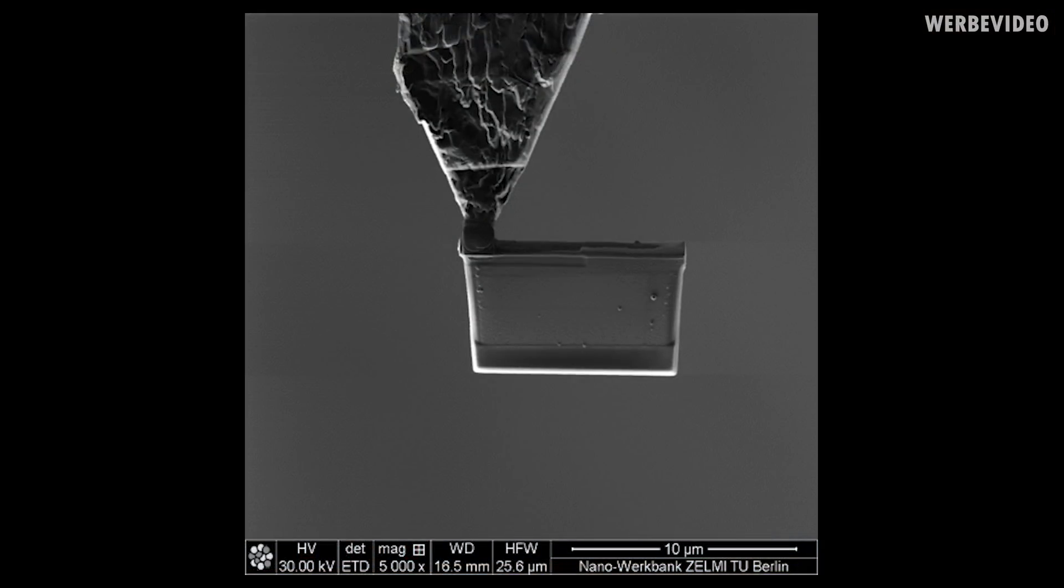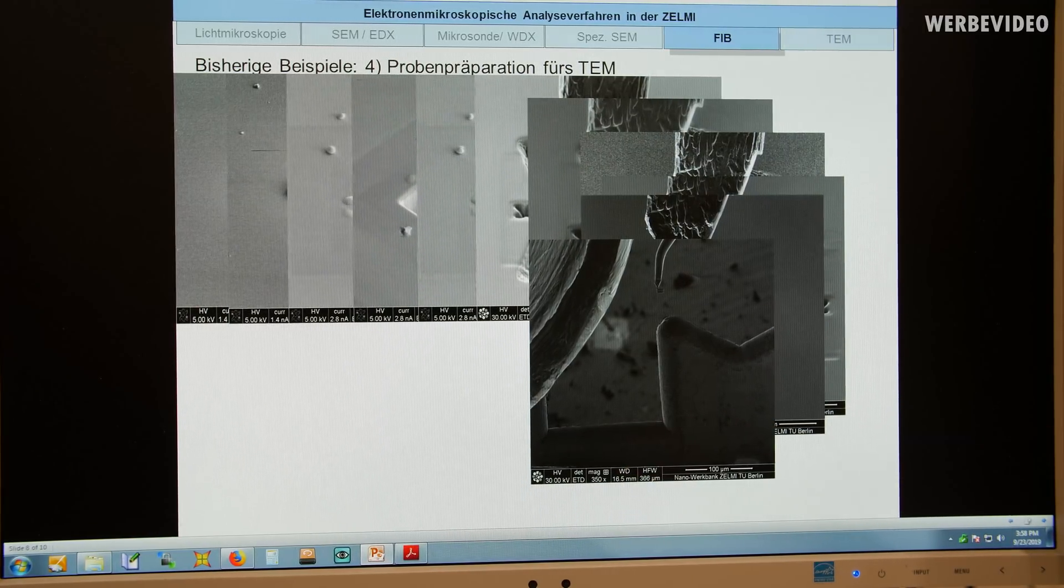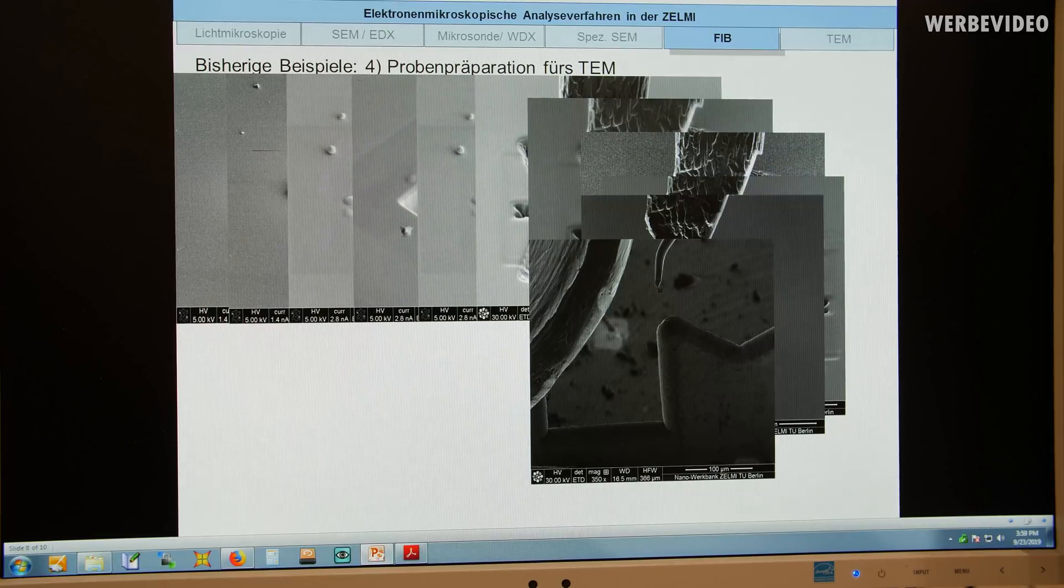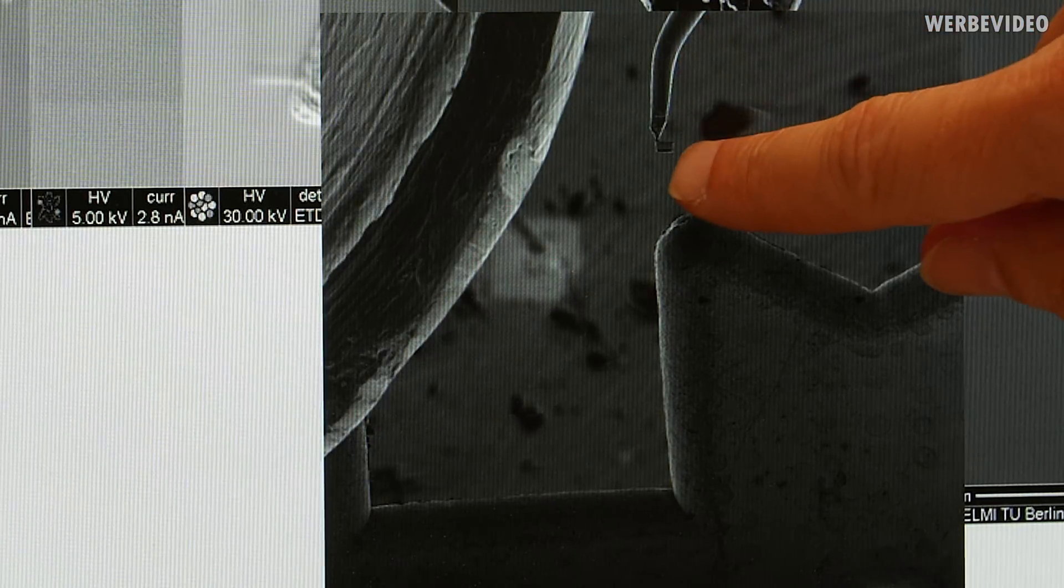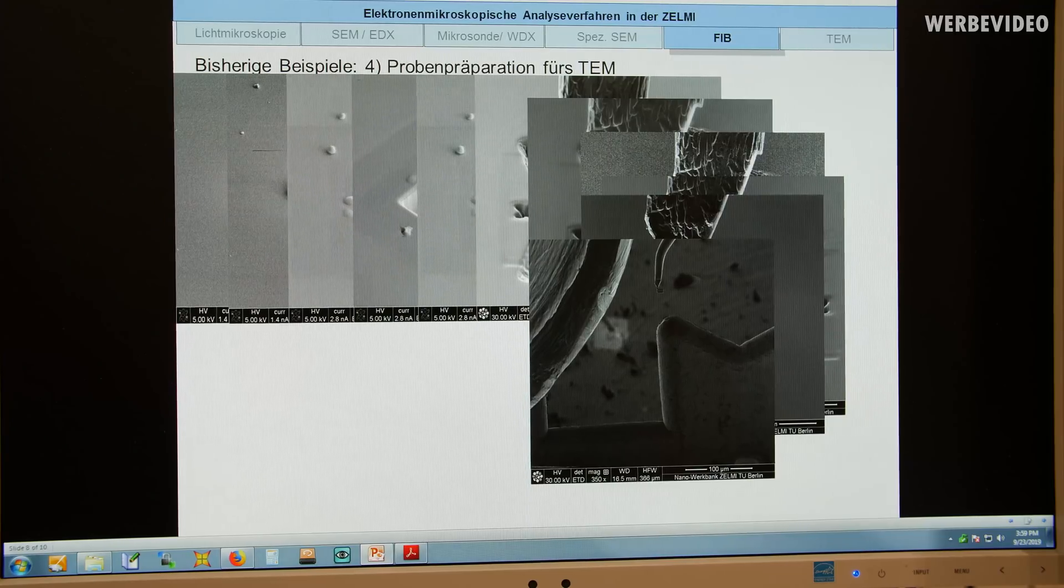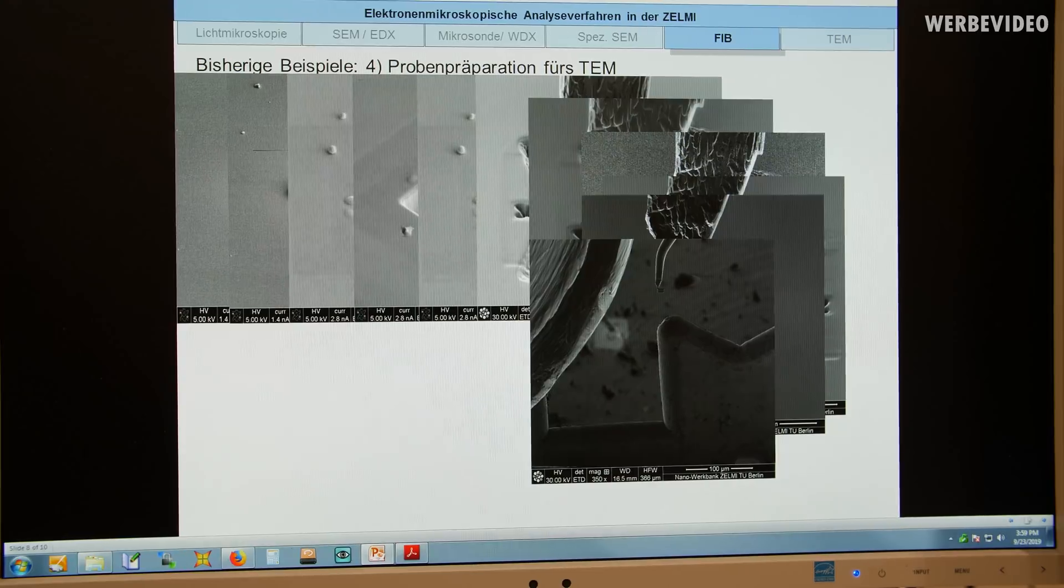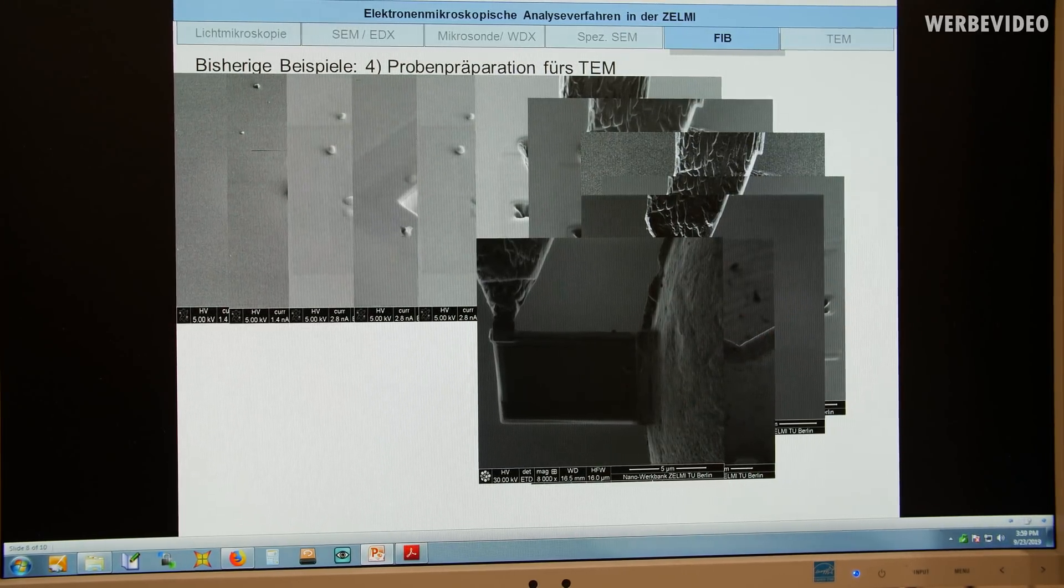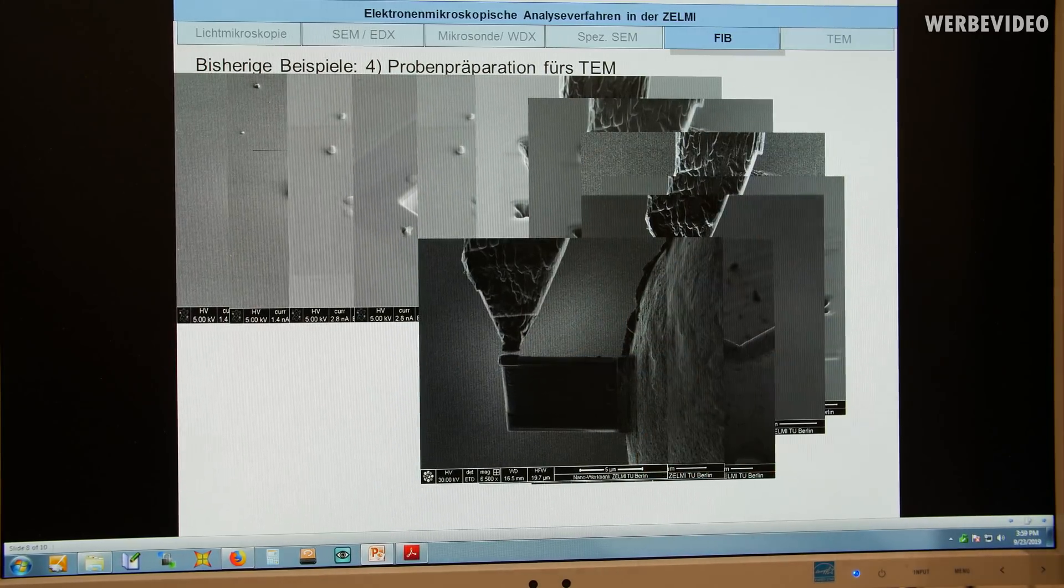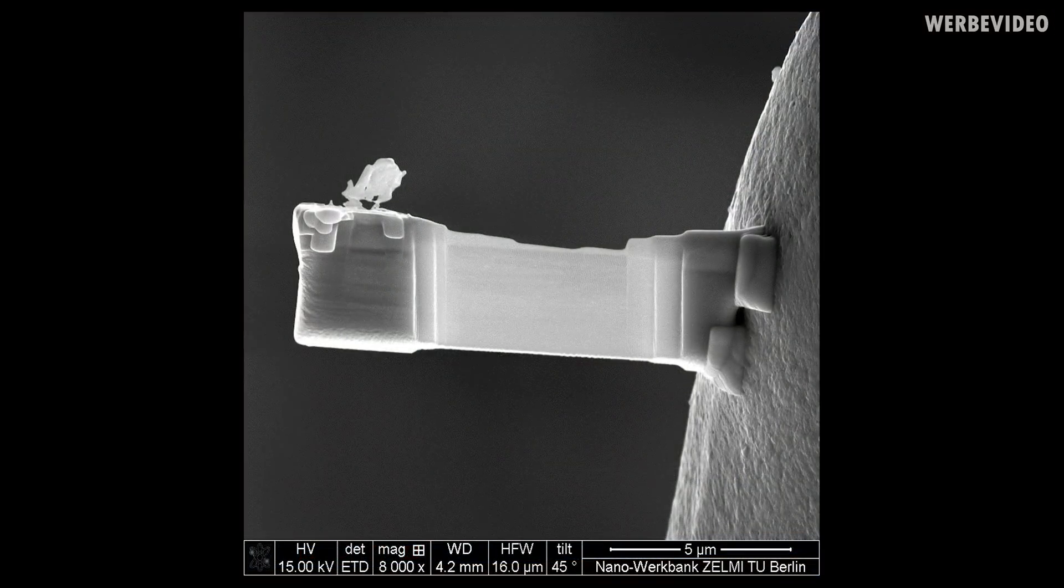Of course, we can't transfer this needle to the TEM, so we need another transfer holder. And this transfer holder is seen here. So this is some structure that has a size of three millimeters that perfectly fits to the TEM holder. And here on top you see the transfer needle. And there we have the small TEM lamella. So this is now another magnification. And now we want to attach the TEM lamella to this transfer grid here. And this is done here. We fix it again with a platinum deposition. Now we release the transfer needle and the TEM lamella is now completely fixed to the transfer holder.